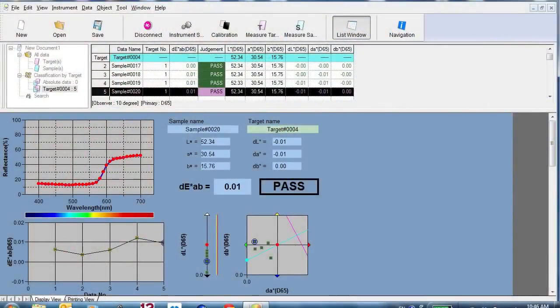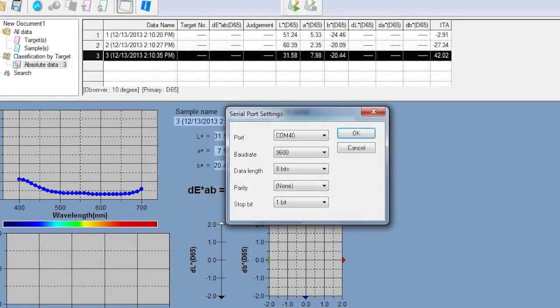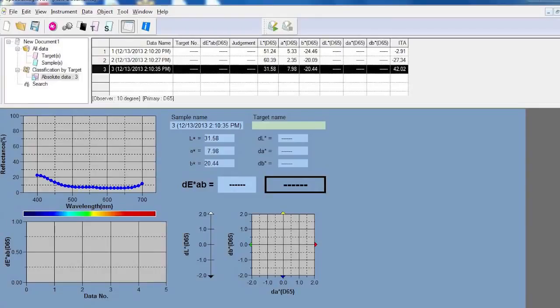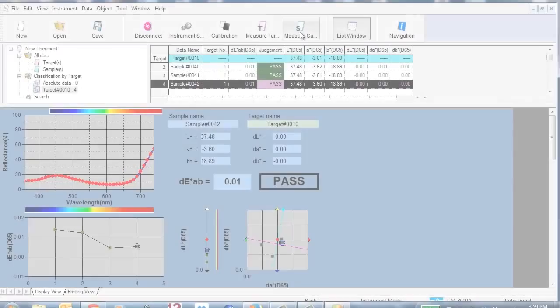Data generated from color measurement can be uploaded to a computer and evaluated in SpectraMagic NX. This software provides a more comprehensive analysis of a sample's color and is used for color quality control.